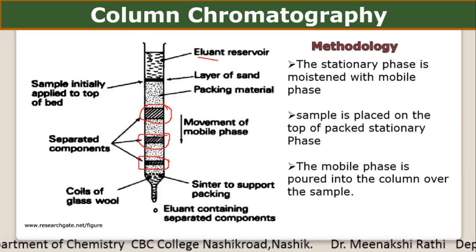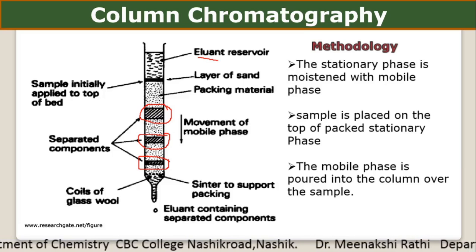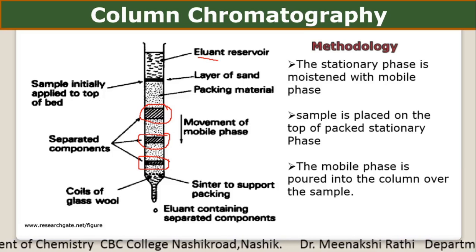Any organic chromatographic grade liquid is used as an eluent.